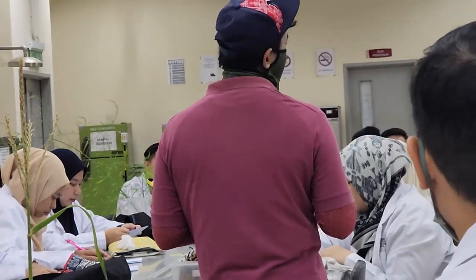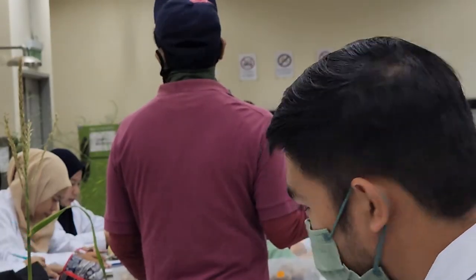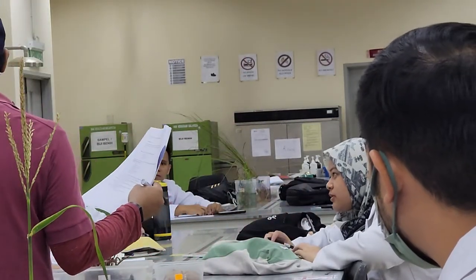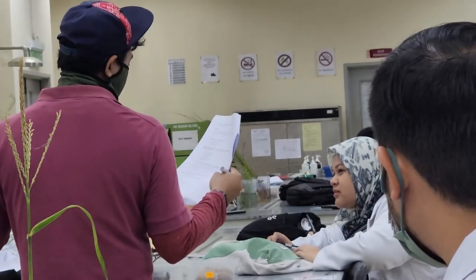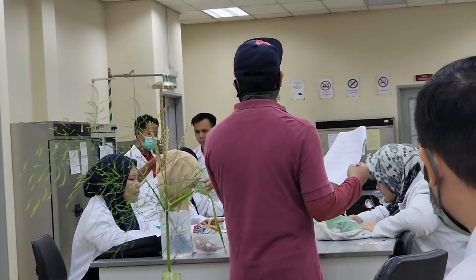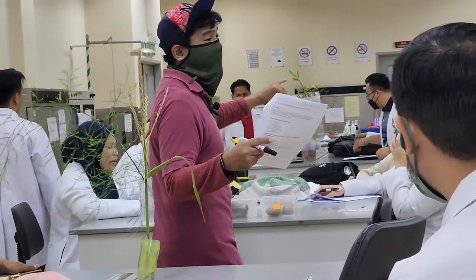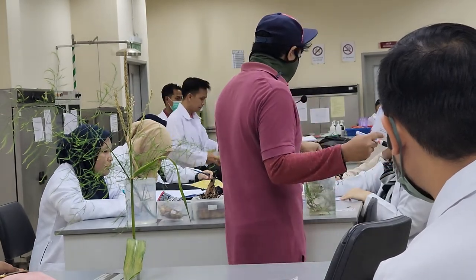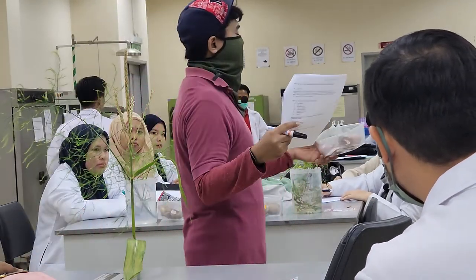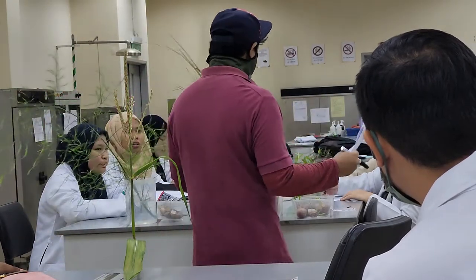Okay, we have ginger, and then asparagus. Bring over here. We have Axonopus compressus, which is the cow's grass, your field grass, you know, football field. And you got the onion bulbs, and Imperata cylindrica.